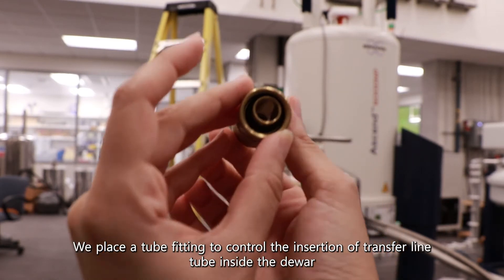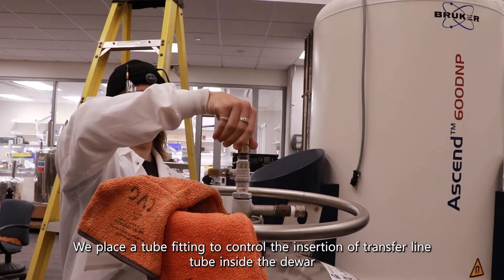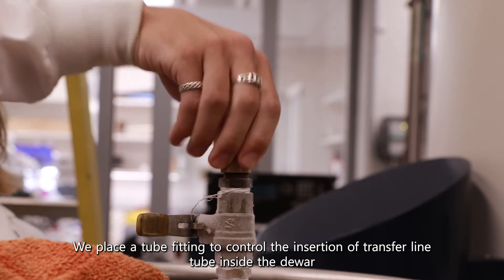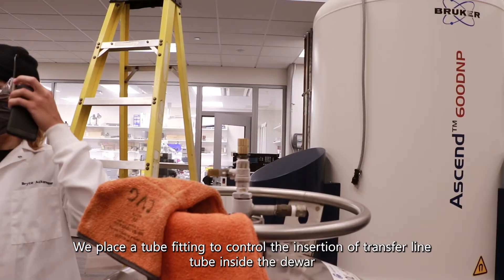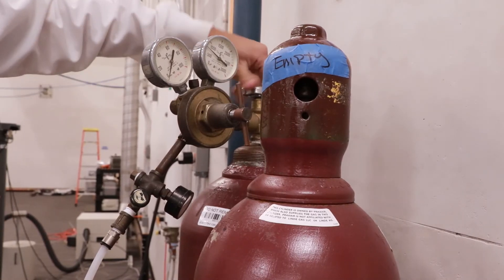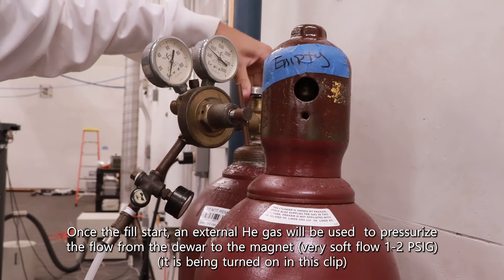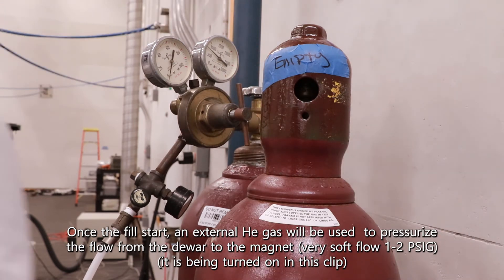We place a tube fitting to control the insertion of the transfer line tube inside the dewar. Once the fill starts, external helium gas will be used to pressurize the flow from the dewar to the magnet.